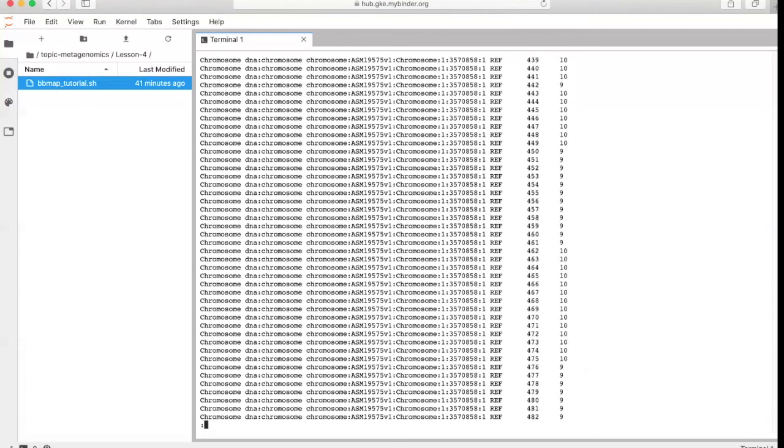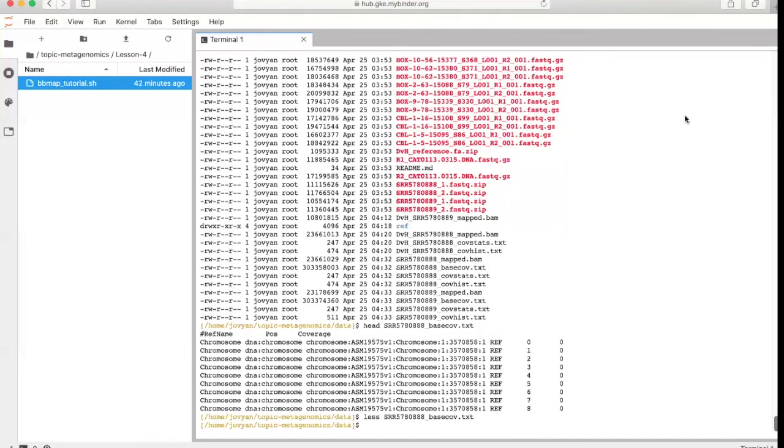It's not the middle. I'm not going to go through 3.5 million bases now to show this to you, but again, if you're using R or Python and you want to plot your coverage per base of the genome, which is a really common thing to do, then this file lets you do it really easily. Okay.